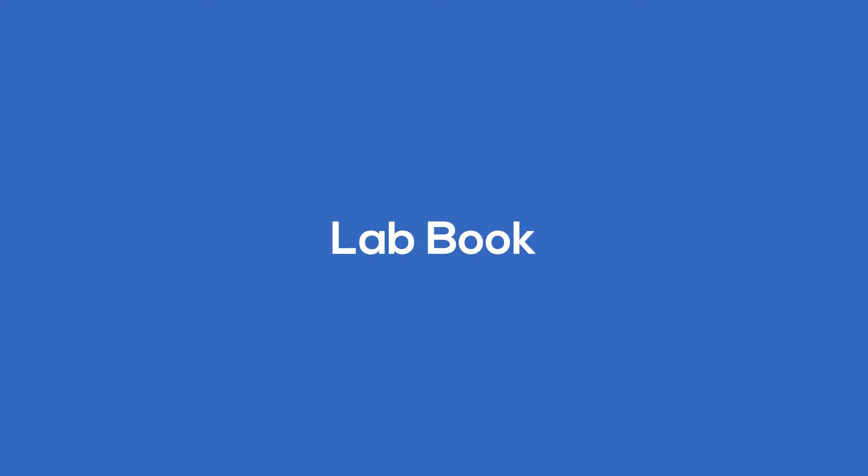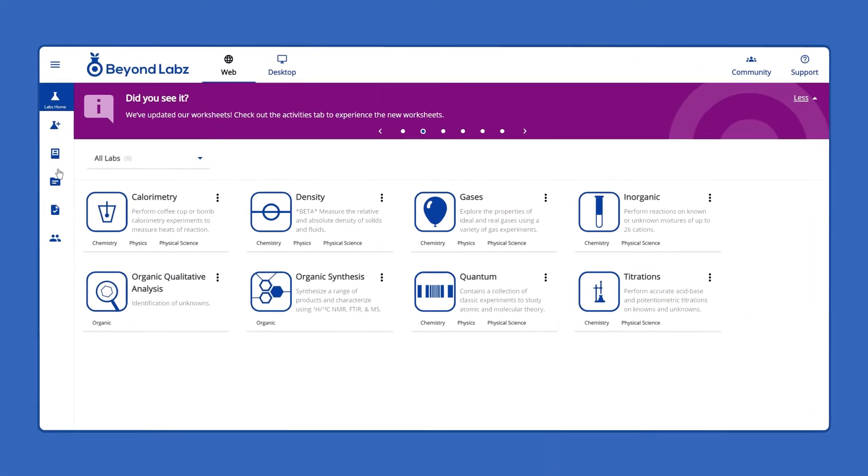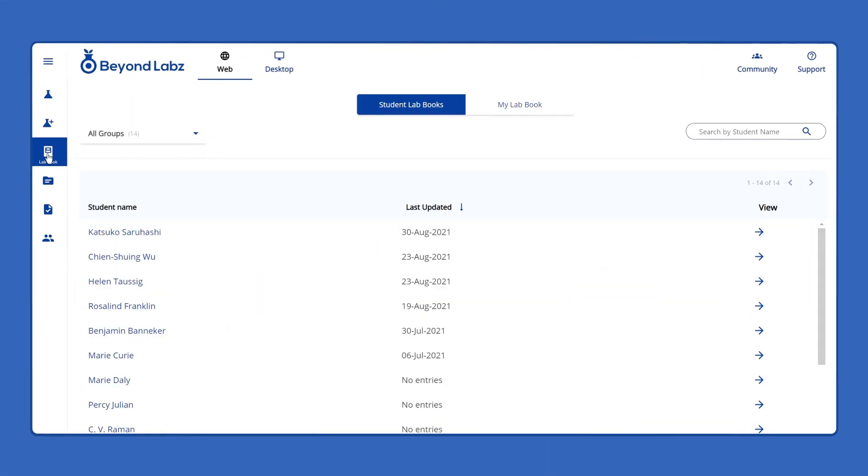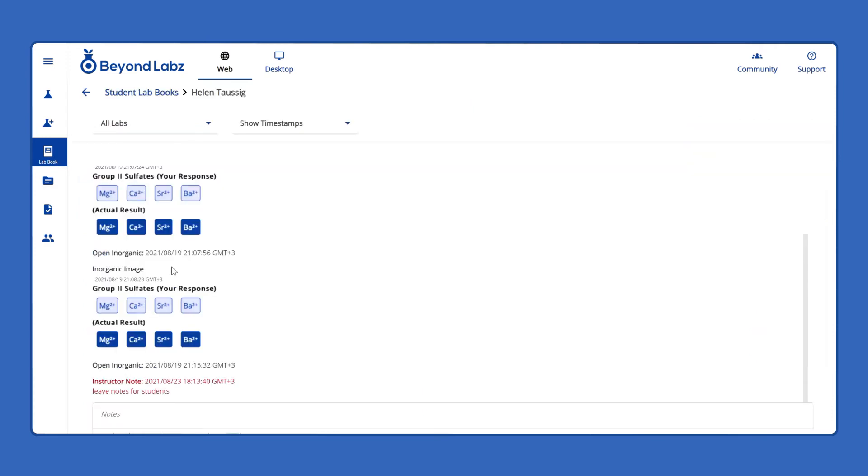In the Lab Books section, view all of your notes and entries. Instructors have access to all their student lab books.